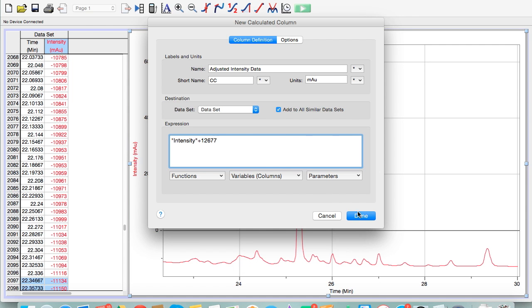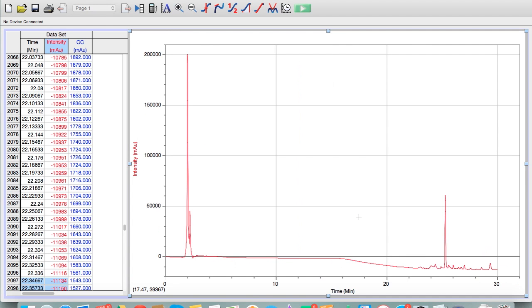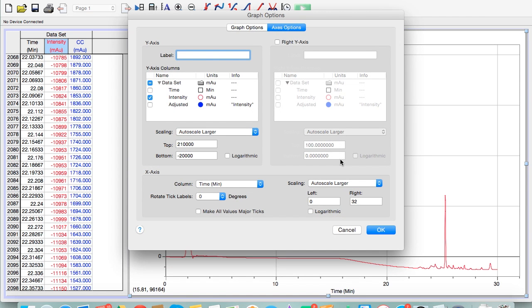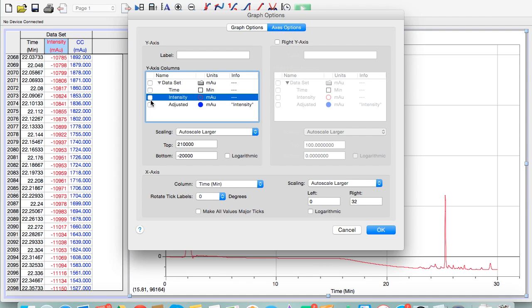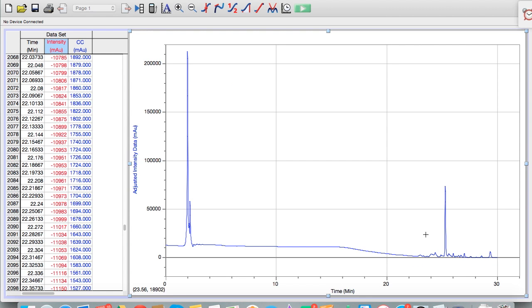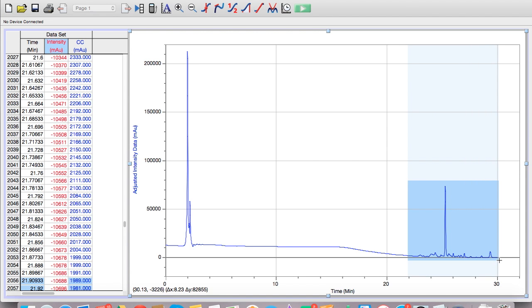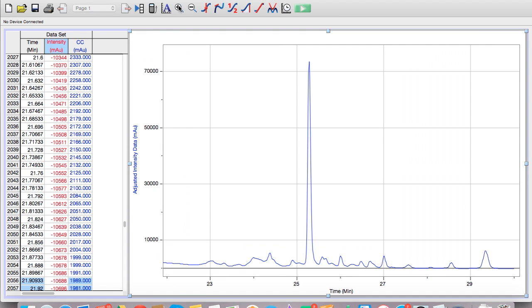Now you'll notice that I have a new calculated column, the adjusted intensity, and every value is 12,677 greater than it was originally. So now let's double click on the graph. Instead of the unadjusted, let's show the adjusted intensity column. Now you can see that if we zoom in back to our region of data that we actually care about, all the peaks are now above zero, which is what we want.